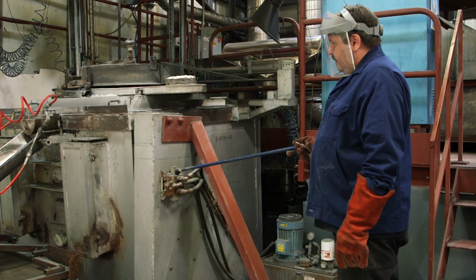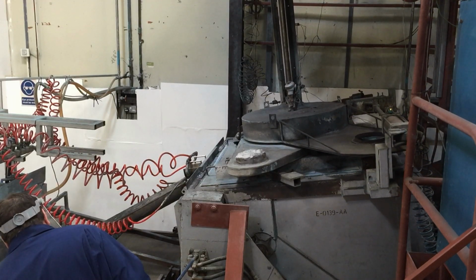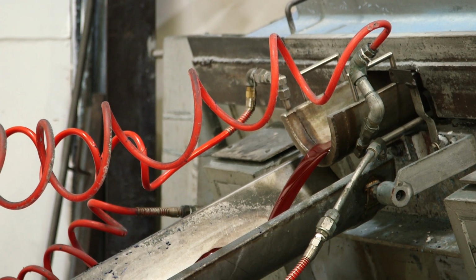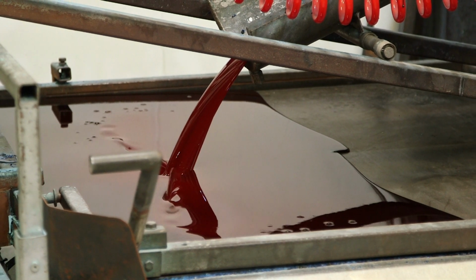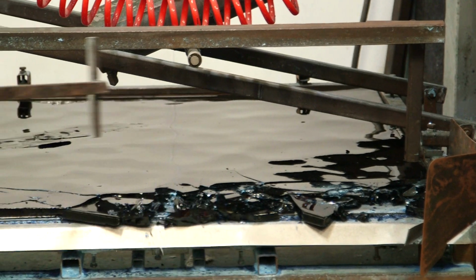This is the melter facility where the phosphate glass is manufactured in a purposely designed melting pot reaching temperatures up to 750 degrees Celsius. Raw materials are pre-weighed, mixed, melted overnight and cast while being cooled. Only the trace elements which can withstand these temperatures are added at this point.